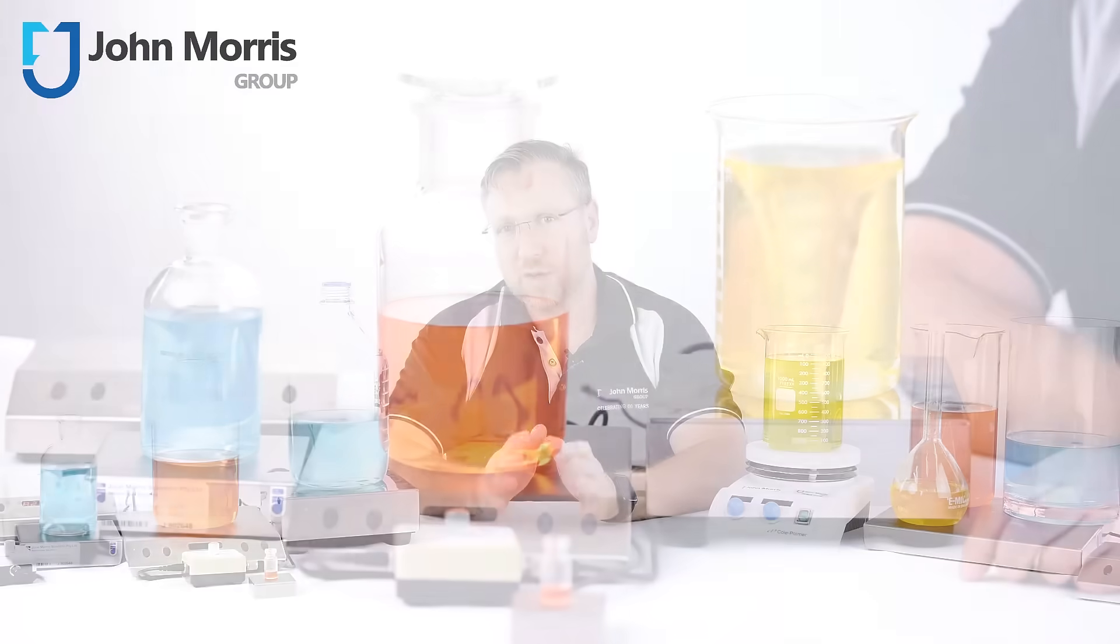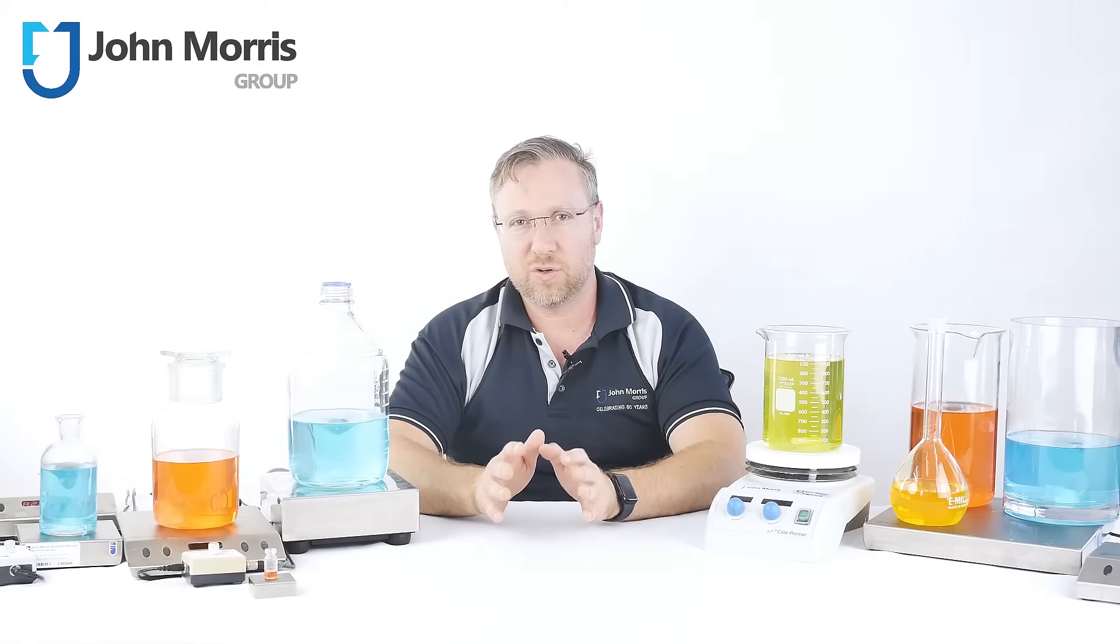Covering the basics, there are two main styles of magnetic stirrers, that is, mechanical and inductive.